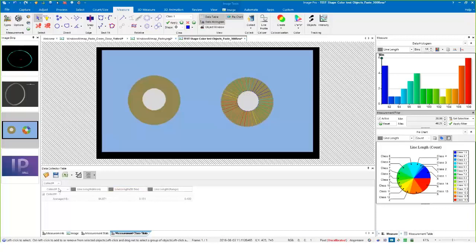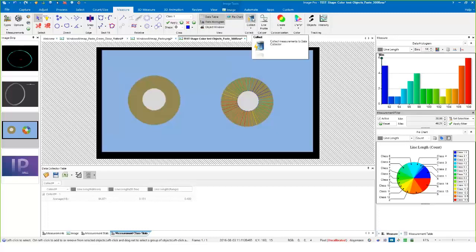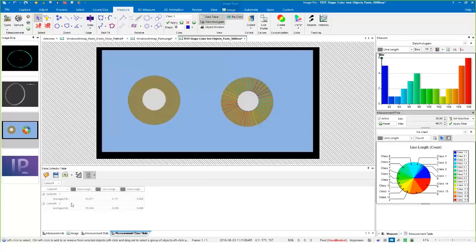If I wanted to add this data into my data collector table, remember on each of the tabs that now includes any kind of measurements, we've added the data collector icon here on the ribbon which makes it more convenient. All I have to do is click on data collector here.